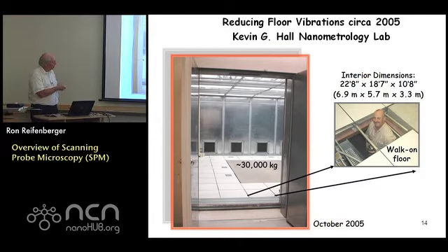So if you pull up one of these panels, you can go underneath and you'll see these big inner tubes, right? That slab vibrates less than a nanometer at frequencies above 10 hertz, right? So it achieves factors of 1,000 vibration isolation over the vibrations that are running around on the floor of the building out here, right?